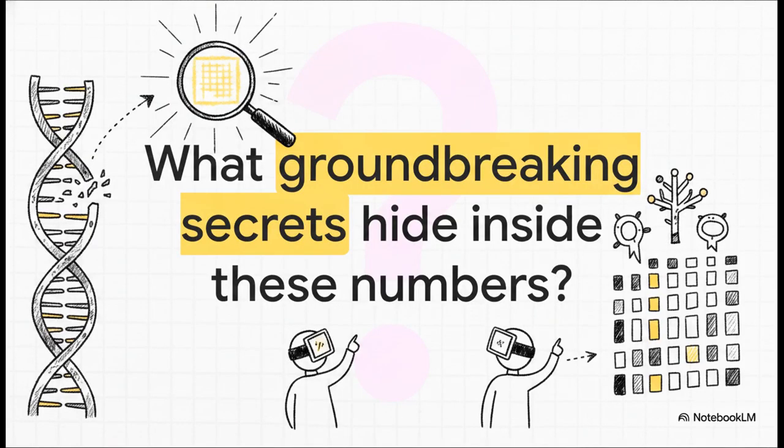Just take a second to think about what we've actually accomplished here today. We took invisible, single-stranded molecules from a cell, chopped them up, converted them to DNA, read them as microscopic flashes of light, mapped them against a billion-letter genome, and corrected the math to build a perfect digital matrix. It's an absolutely wild journey. But the real question is, what groundbreaking biological secrets, what disease cures or massive genetic discoveries are hiding inside those columns and rows? Well, that's exactly what data scientists get to extract next.